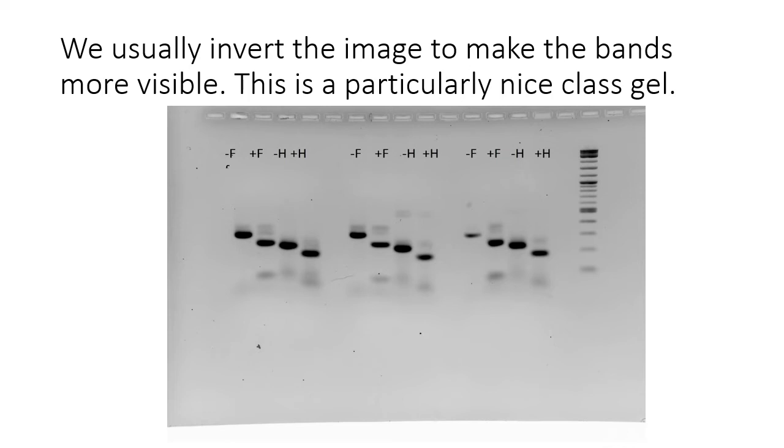Now, I want to point out something right here. We are expecting to see two bands in each of the digests, but those bands are very small, and they kind of run with the smudgy stuff at the bottom where the primers and things are. So in analyzing our data, we're just going to look at the larger bands and not worry about the smudge at the bottom. We're simply going to analyze untreated product, treated, untreated, treated, and see whether there's a shift in size.